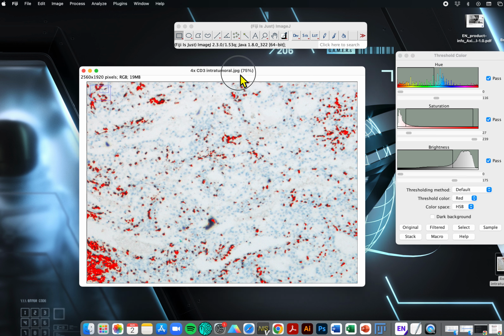So I'm going to zoom back out to the whole image. Looks like there's some noise down here, so again, we can try to eliminate that. So that kind of helps it. Once you've selected what you want counted, you hit the select button.